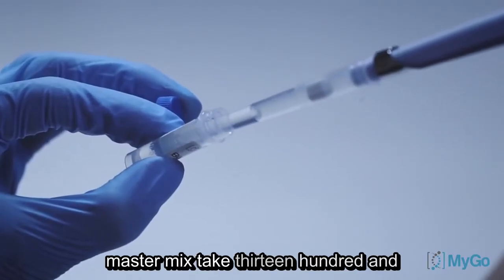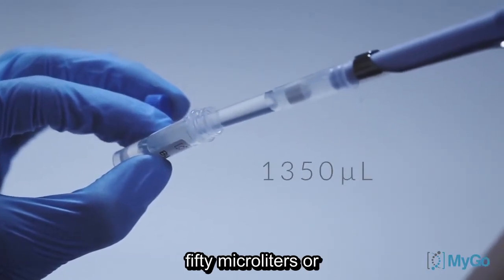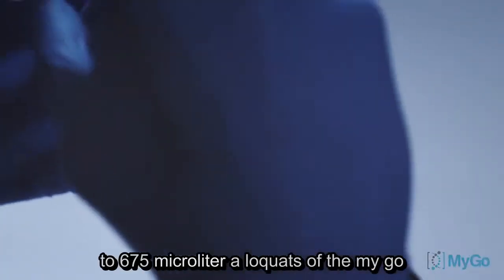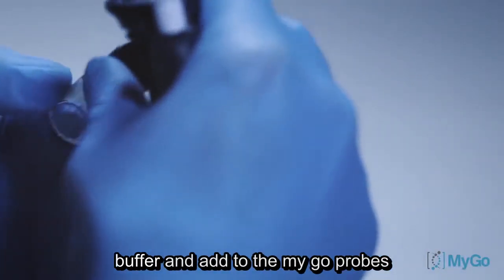First, we need to make up the master mix. Take 1350 microliters or two 675 microliter aliquots of the MIGO buffer and add to the MIGO probe's master vial.